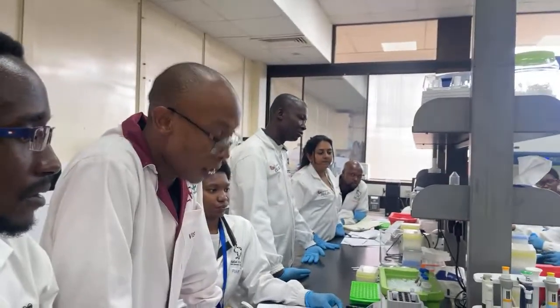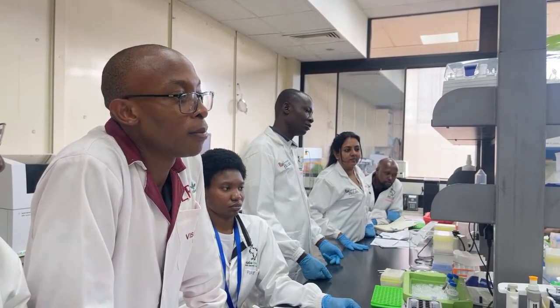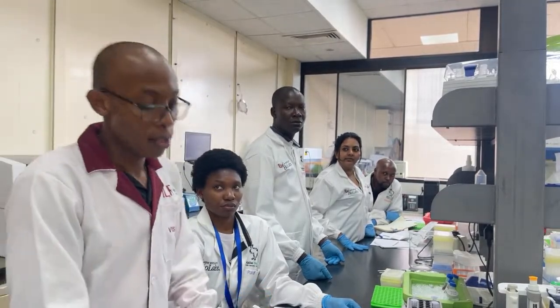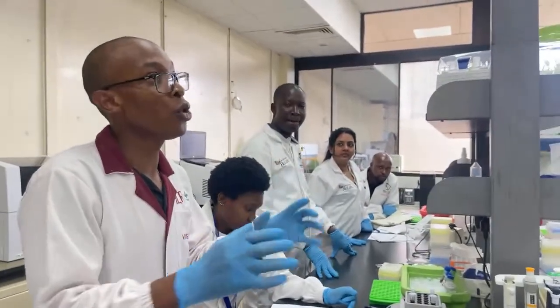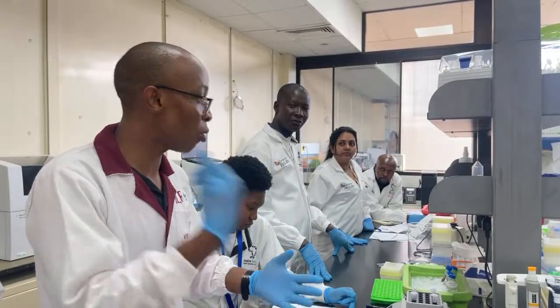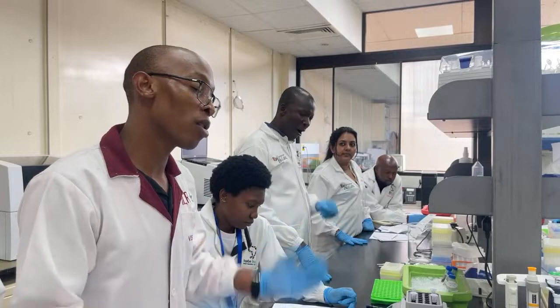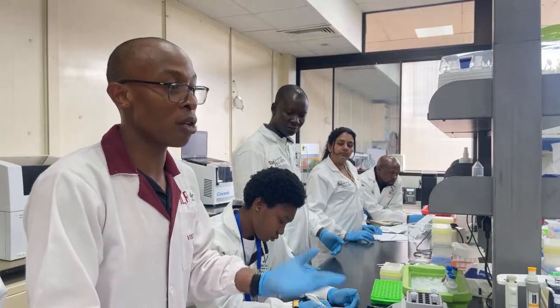Let me ask you another question. What if you do all the stages that you have covered, and you set up, then look into the kit, that binder, and then the cleaning step. Can you clean it using that step? You can, but I've never seen anyone doing that. So it is something that you'll have to troubleshoot. Those that do CTAB will use AMPure beads. They will do clean up with AMPure beads, do washes, because you still use alcohol there to wash as well. Sometimes it works, sometimes it doesn't. So to move from CTAB and use the extracted material with the kit, it's a good idea theoretically, but I've never seen it work. I've never tried it.